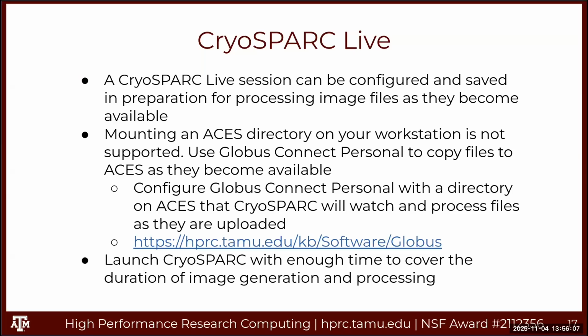For that directory, there's not a way to directly connect data streaming to it. What you'll need to use is Globus Connect. Install this on your desktop or whatever machine you're using that has the data. And then we have a web page here that will show you how to connect to the ACES cluster. And then from there, you can drag and drop image files as they're created into the directory that you specify.